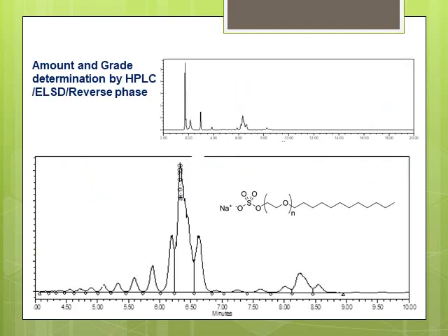The chromatogram that we see here is of a dosage form that I was reverse engineering, and the SLES is shown as multiple peaks between 4 up to 10 minutes. The earlier peaks that we see in this chromatogram are related to the other excipients. So using this, we can do quantitation.